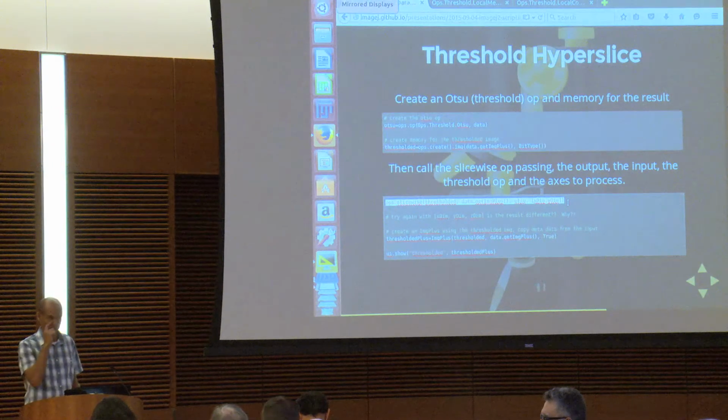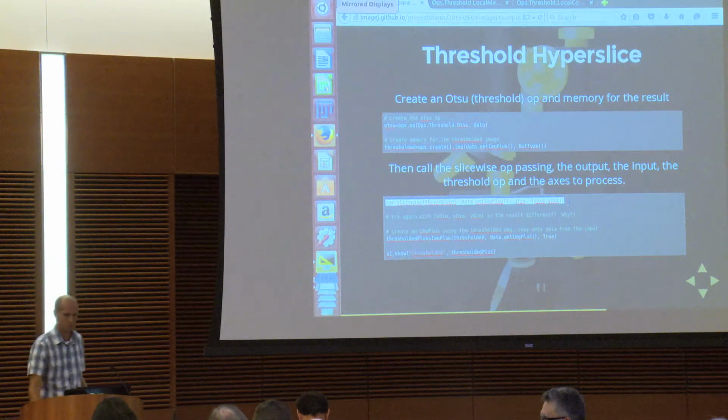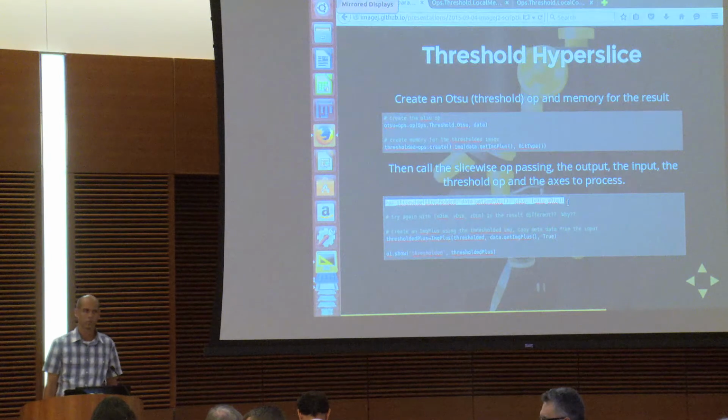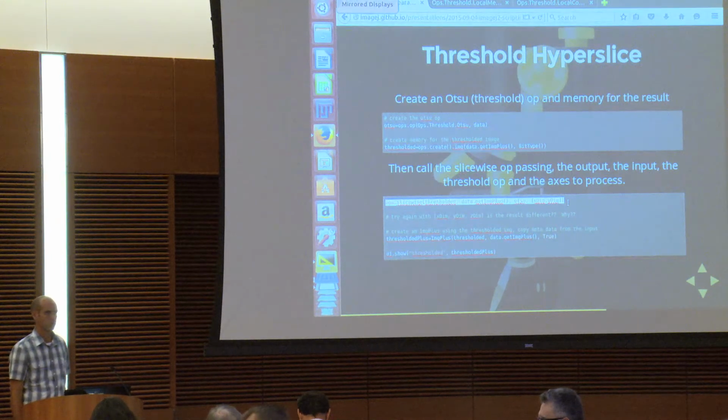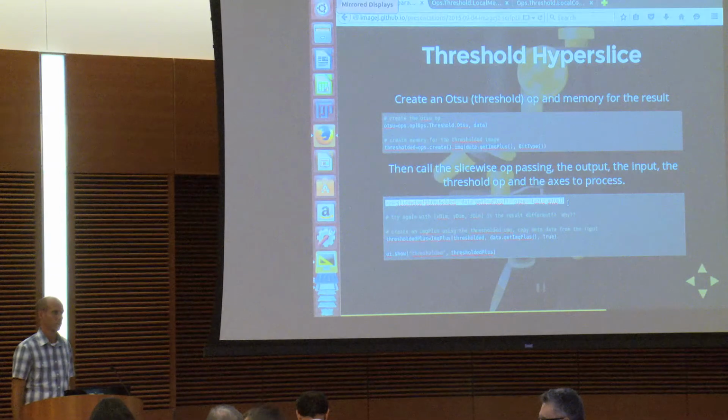If you write an op that does something fancy to a single pixel, then you can apply that op pixel-wise across your entire n-dimensional image using the map op. So that's a perfect example here. And to make map super general, you just have to make sure that whatever operation you pass into map conforms to certain requirements, like defining which input is the one that I'm going to be able to vary. Yeah, that's why we named it. It's a common name.